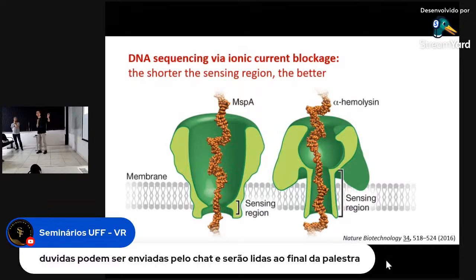So I didn't tell the whole story here. Actually, for Oxford Nanopore Technologies, they don't have single base resolution. They always get the signal from 3 bases at a time, but then through some clever algorithms, and because you always know that one base is moving out and the next base is moving in, you can actually decode the base sequence this way anyway. So one of the advantages for 2D materials is that the size of the pore opening is the same as in the biological pores, but the thickness is in principle 0.